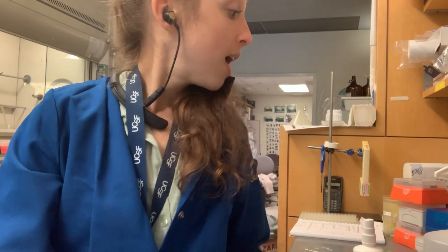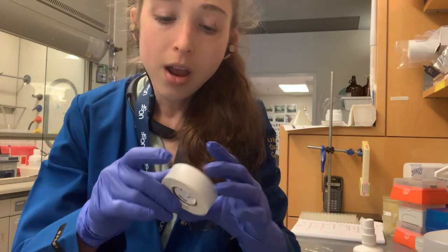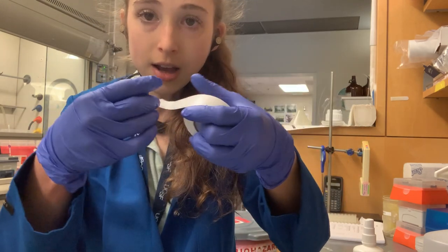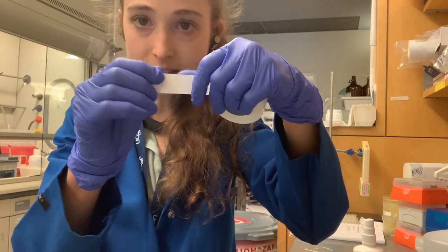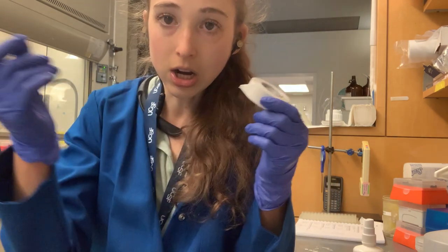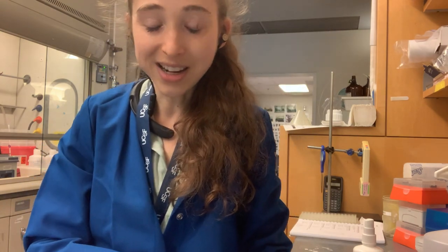Those were just some notes on labeling from someone who labels a lot of stuff. When you label a bottle, make sure to fold a little tab on your tape so that it's not going to get stuck down and be hard to remove later.